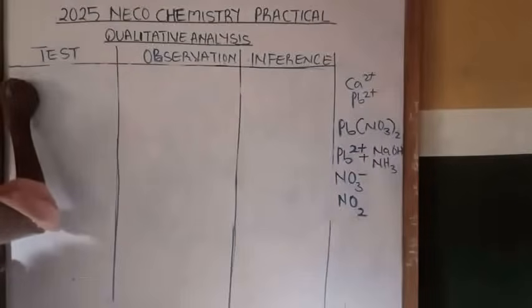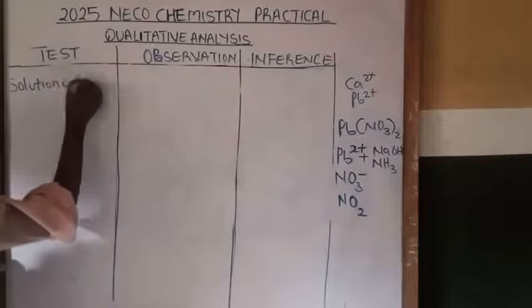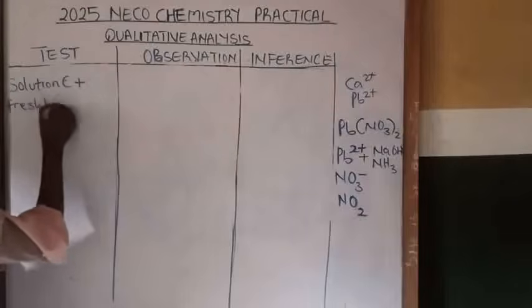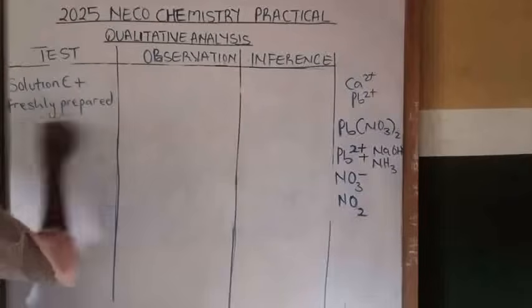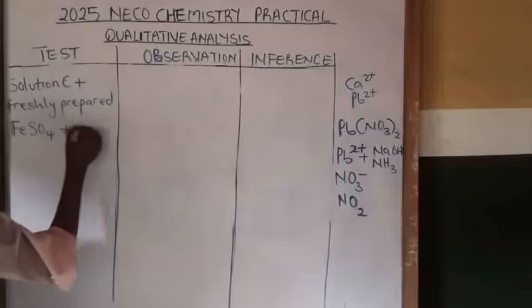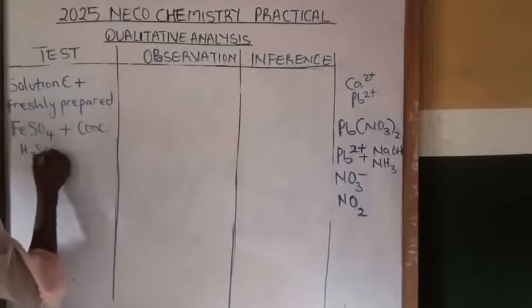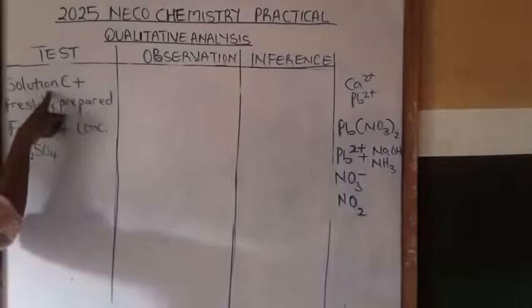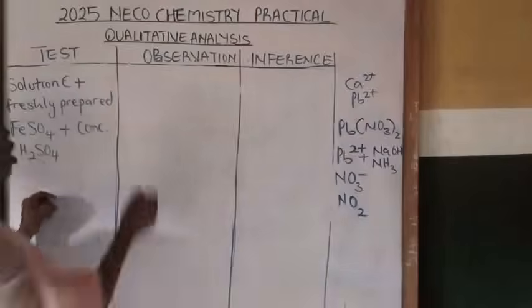So to solution C plus freshly prepared iron sulphate and concentrated H2SO4.